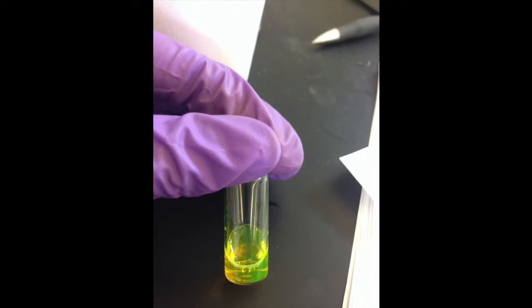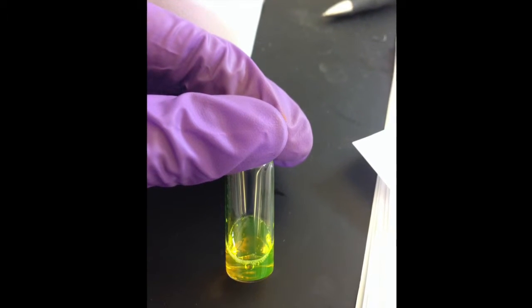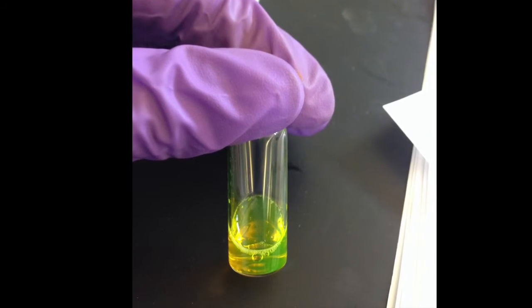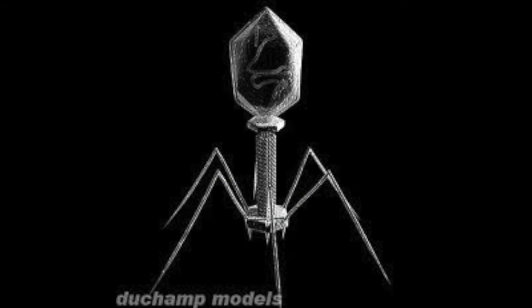This week and continuing on to next week, we are fluorescently labeling BSA molecules. We plan on using the BSA as a temporary substitute for the phage so we can experiment with how it will bind to the PEI and change the cyclic voltammogram. In a few weeks, we will inoculate bacteria with virus provided by the chemistry department from UCI to produce the phage that we will attach to the PEI layer.